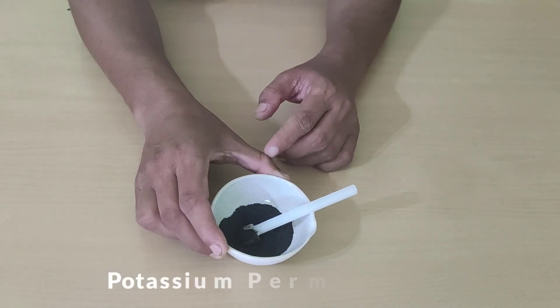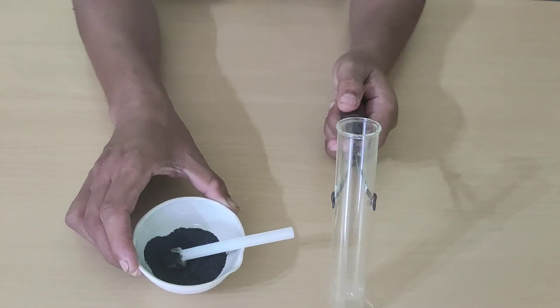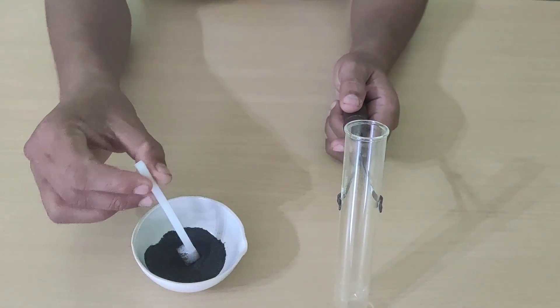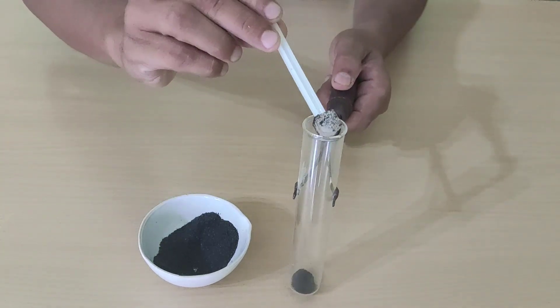This is potassium permanganate powder. We will take this powder in this test tube. We will take 2-3 grams.